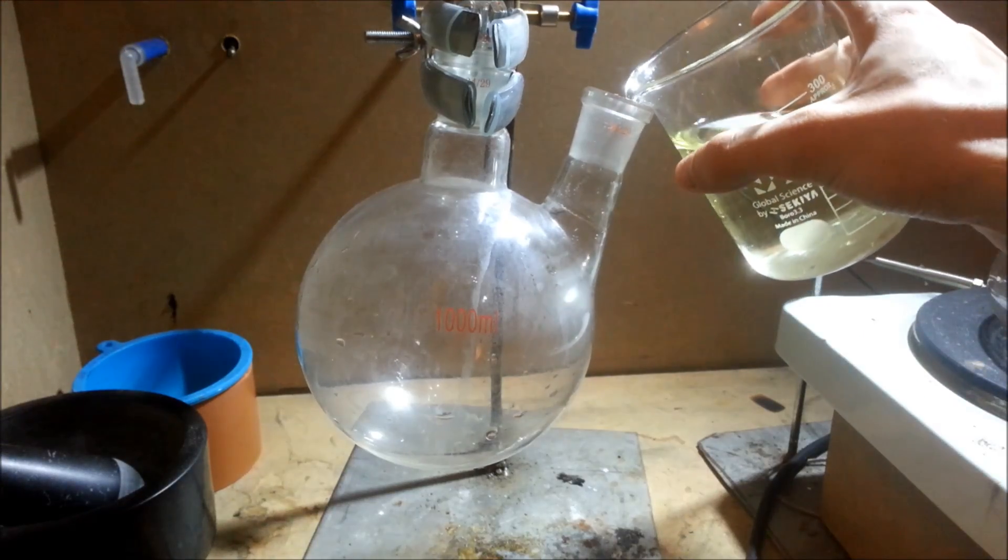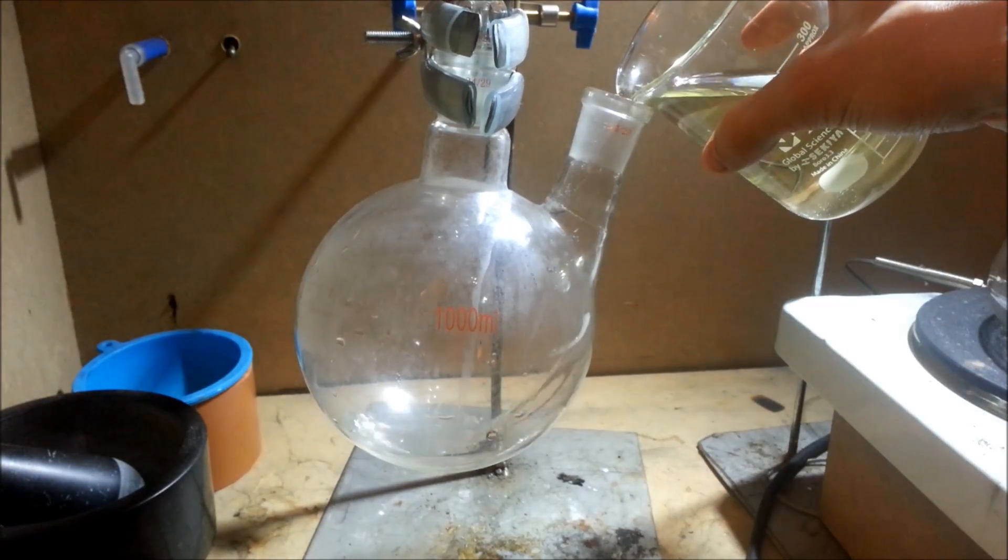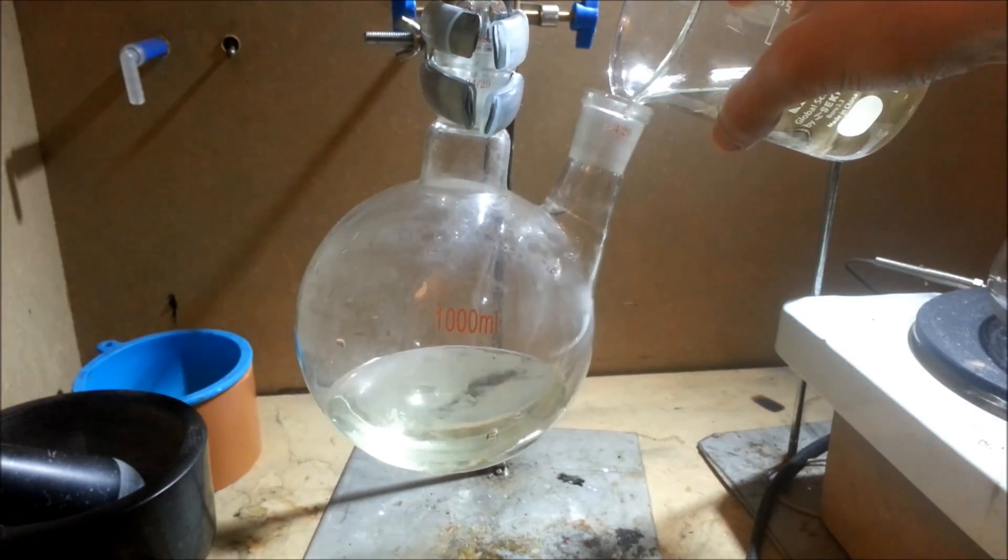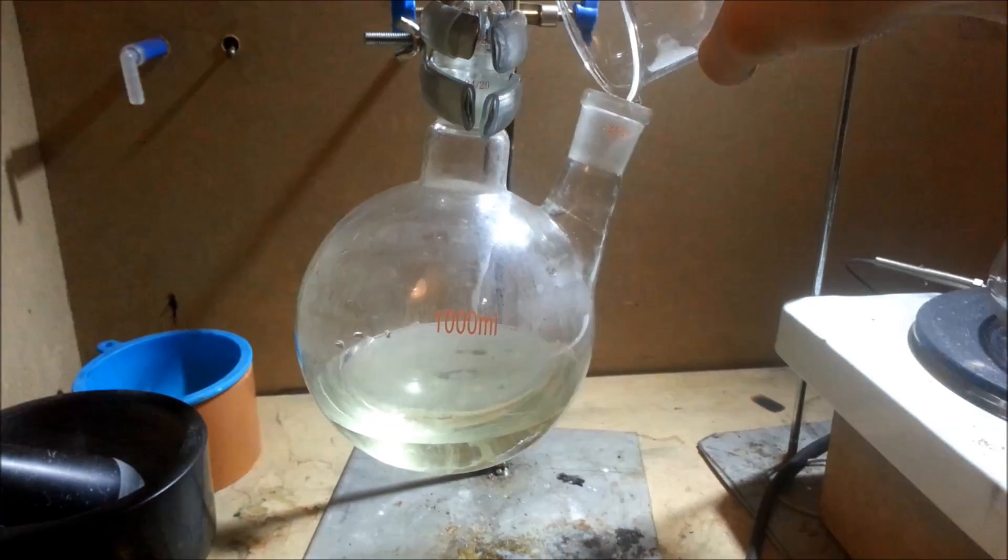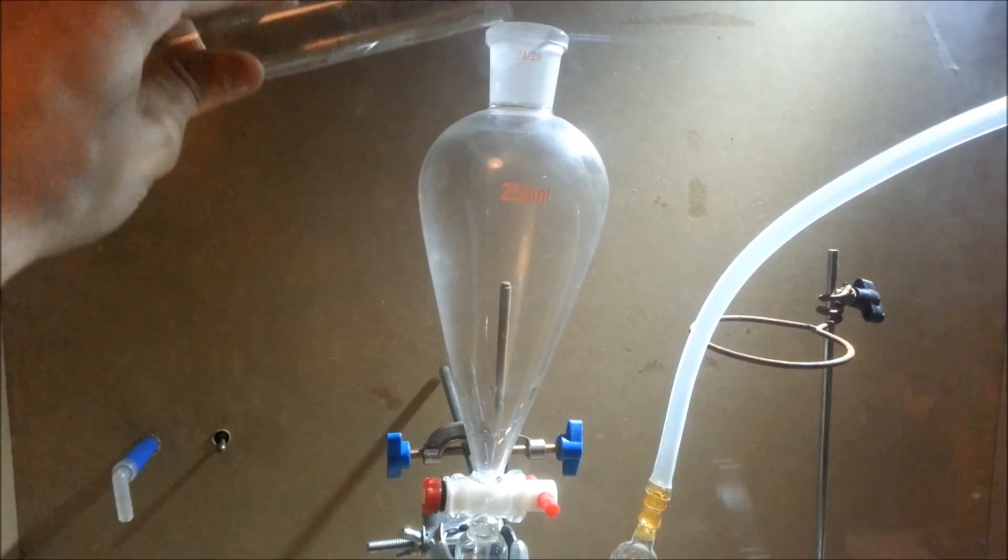Now, 400 milliliters of 0.6 molar sodium hypochlorite solution was added to the round bottom, followed by the addition of 50 milliliters of 8 molar hydrochloric acid to the separatory funnel.